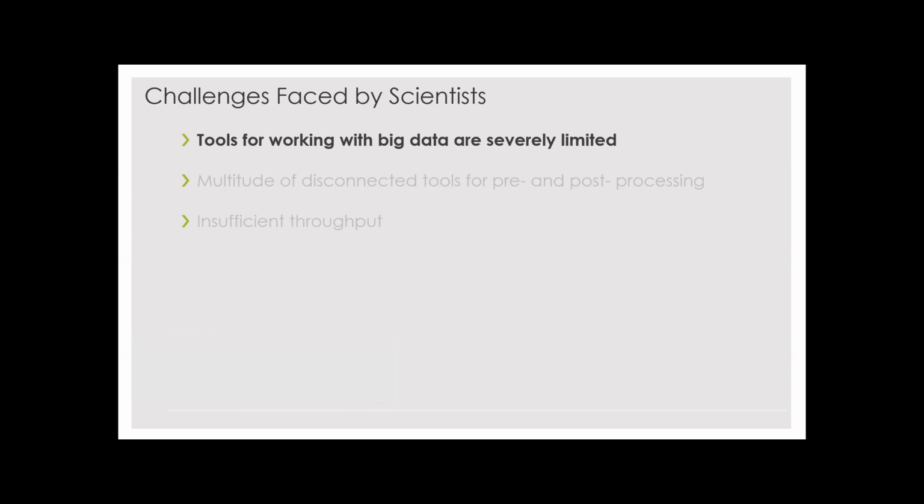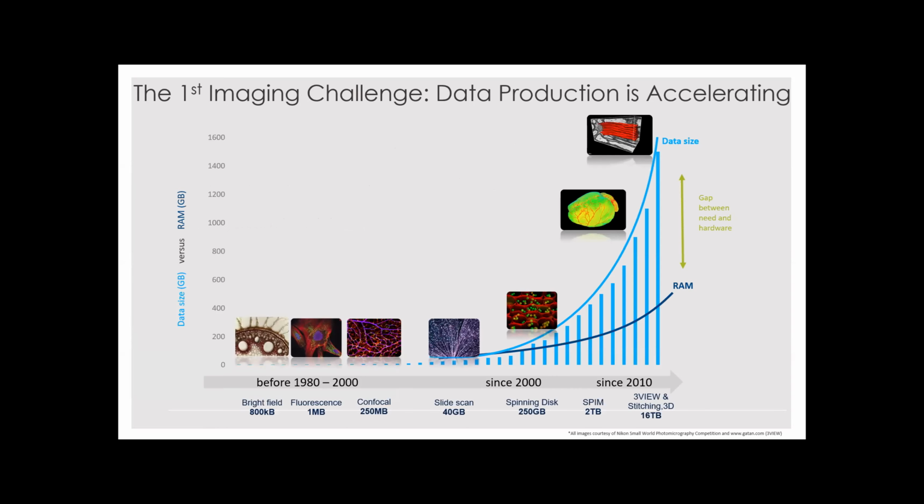So we're going to start with the first one, and probably the most important today, which is working with tools to handle these really large data sets. As you maybe already knew, or you've definitely learned in the workshop so far, more techniques have come out and they have led to a severely increased data size for individual acquisitions.